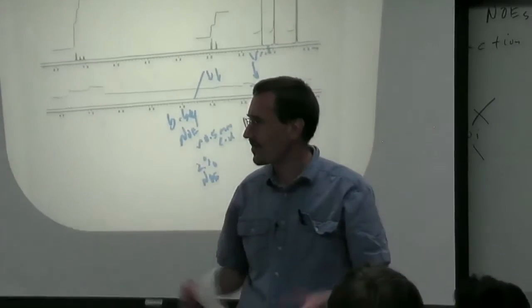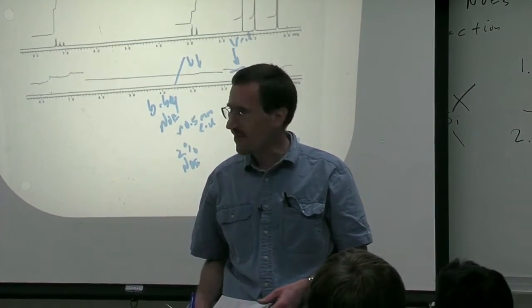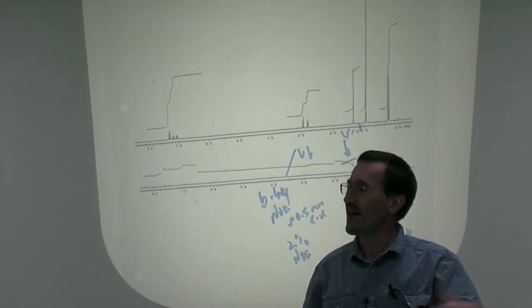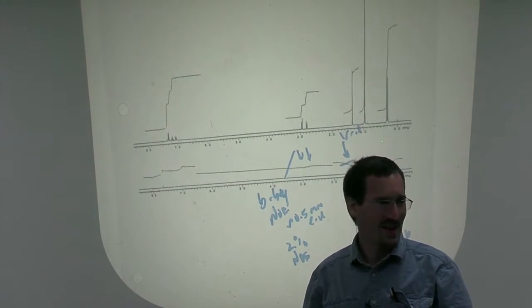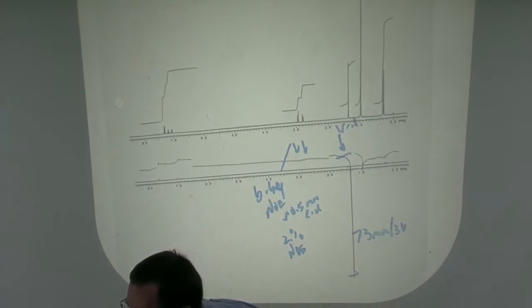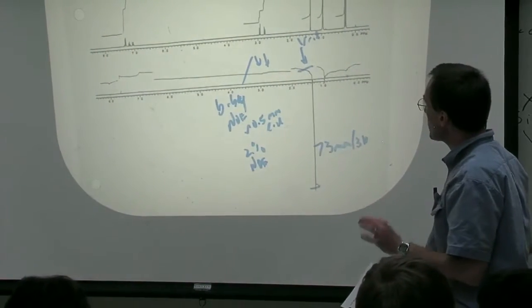And later on, if I were making a natural product and I find it doesn't match the published spectrum, my thesis would be titled Total Synthesis of Epi-whatever the natural product is, or iso-natural product. You know, I'd still get a PhD, but I probably wouldn't get a paper in JACS or something like that. So you really need to be careful. This was a good example.